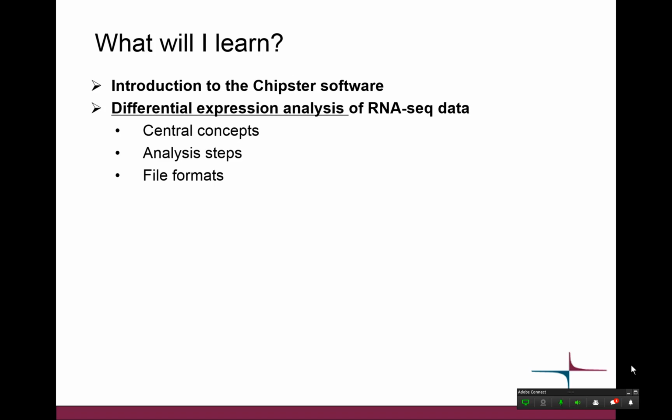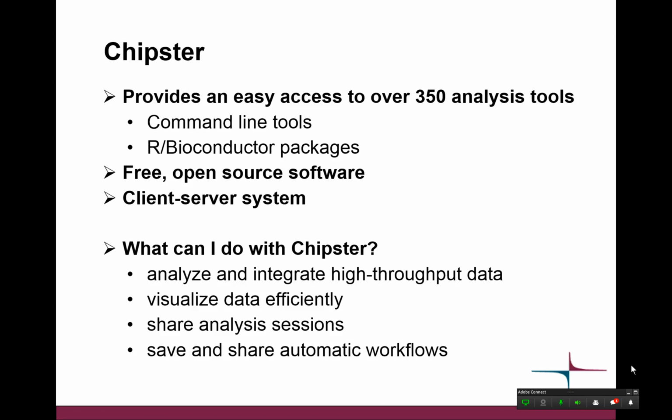Okay, but yeah, today we are briefly introducing Chipster software, and then talking about the differential expression analysis of RNA-seq data. And Eija will now shortly present Chipster software.